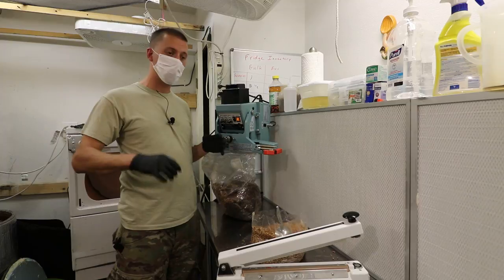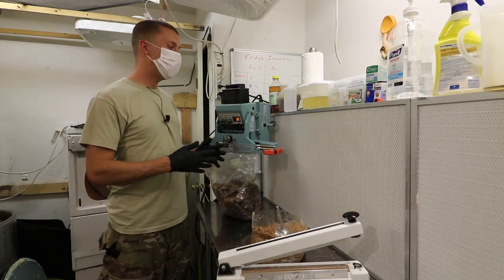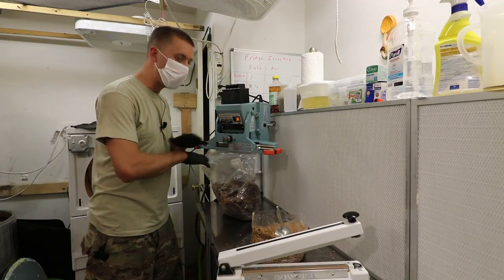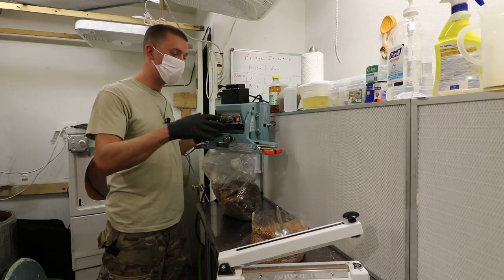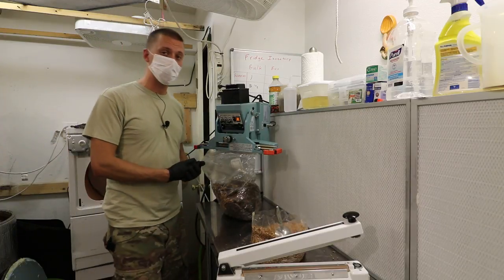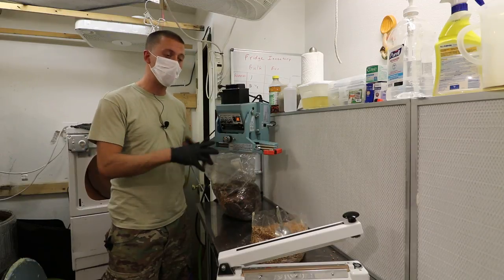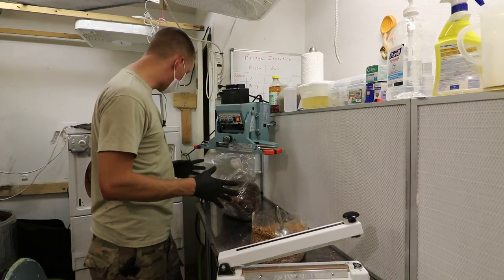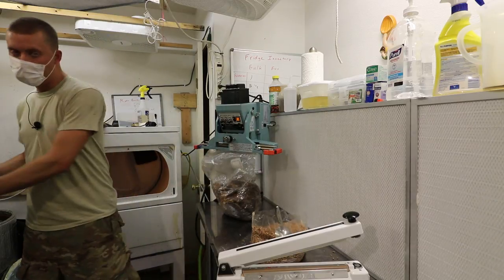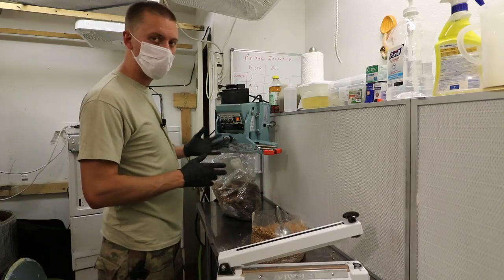I used to make a row of bags, open them all up, and scoop or pour into each one. The issue with that is you have a lot more bags open at once. By keeping it to one or two bags at a time, it's a much quicker, smoother process. You're not moving around as much — my whole workstation is right here, with my feet moving maybe a couple inches at most.